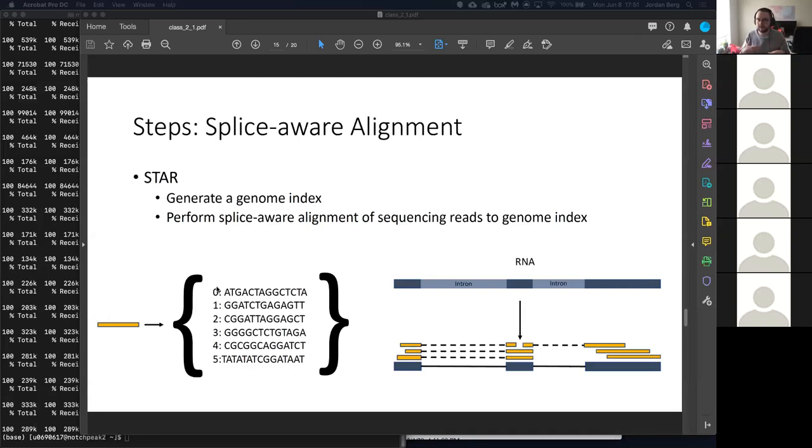That's kind of a simplified version of it, but that's how it's able to quickly search through the whole genome without taking, okay, here's one read, check this section in the genome. Nope, not that one, let's go move down a base pair. Not that one, move down another base pair. So that's what helps this happen in the matter of minutes to hours and not years on the computer.